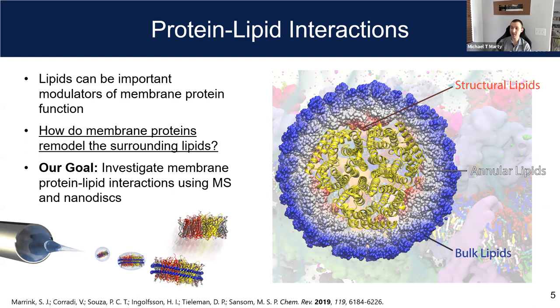And the basic idea was, what if we could just reach down into the membrane and yank out a protein and kind of see what comes with it, right? Very similar to a lot of the SMALP studies that have been done, right? We're just trying to do this in the gas phase rather than in solution.